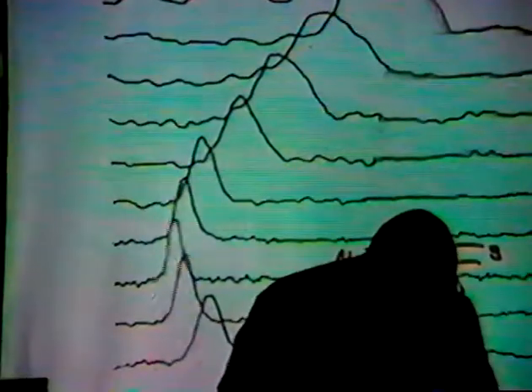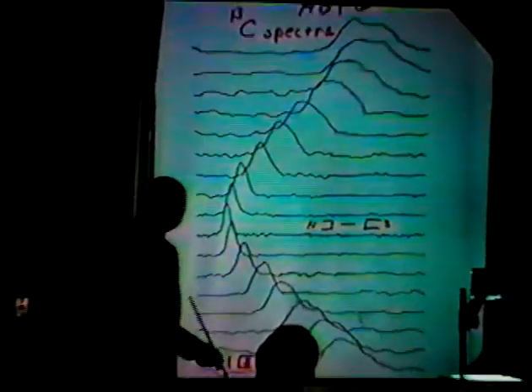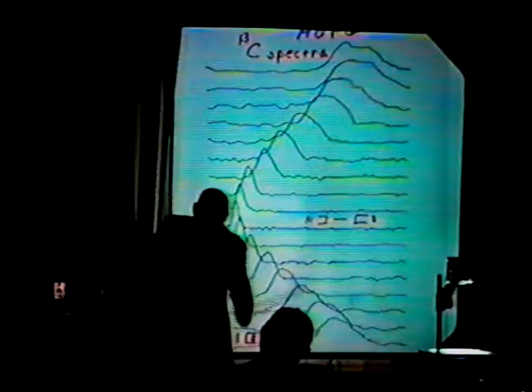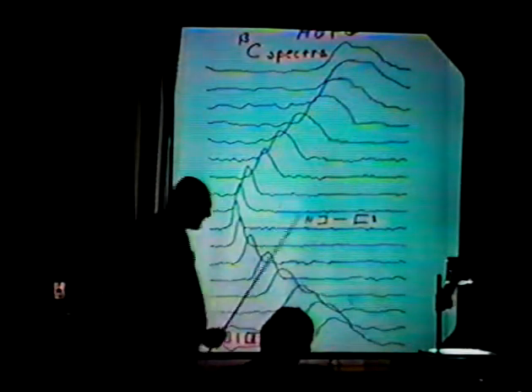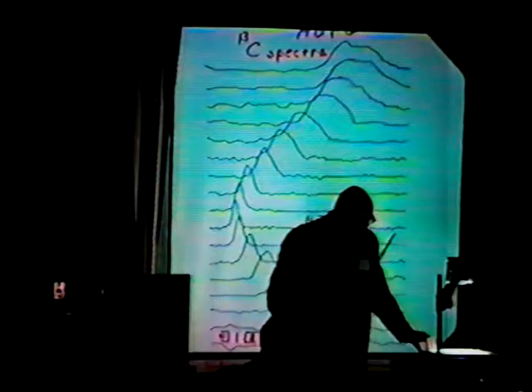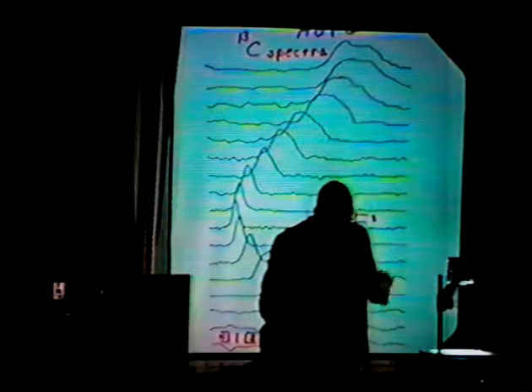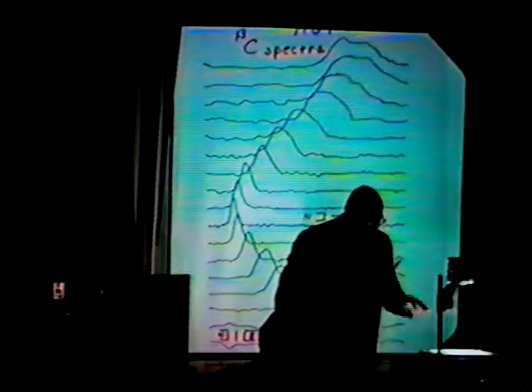broadening of the line. So how then do I explain these broad lines? Well, I assert that this graphite is really very poorly crystallized, and we don't have just AB stacking, we have ABC stacking, which is another, and these can be random runs of these in the crystal. So that even though graphite is a crystalline material, it is not perfectly crystalline, and that's why we get those broad lines.